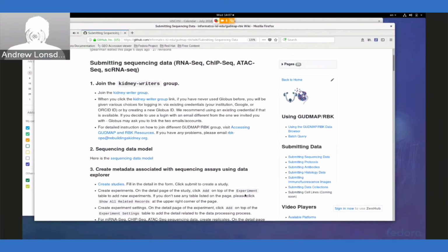Just one question on the GEO. I think Hong Suda mentioned earlier about metadata being exported to GEO. So I just wonder if you could comment or clarify what the plans are for integration with GEO, or if people need to upload to both places, what this system can do to make it easier.